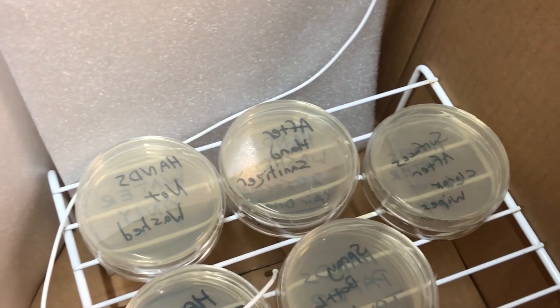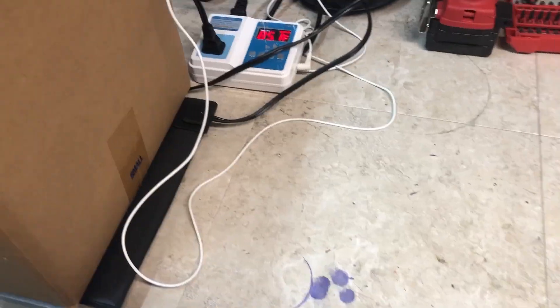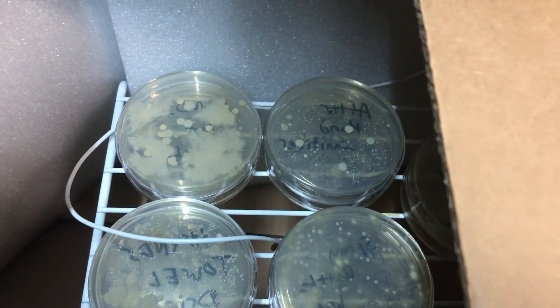All my plates are placed in the incubation chamber and we're going to come back in a week to see what happens. It's only been two days and I've already taken a peek — there's already stuff happening, so let's take a closer look.